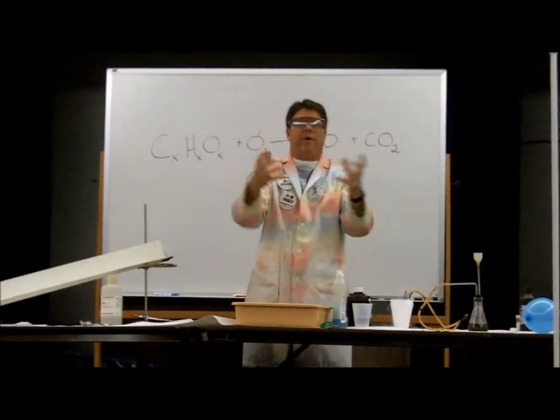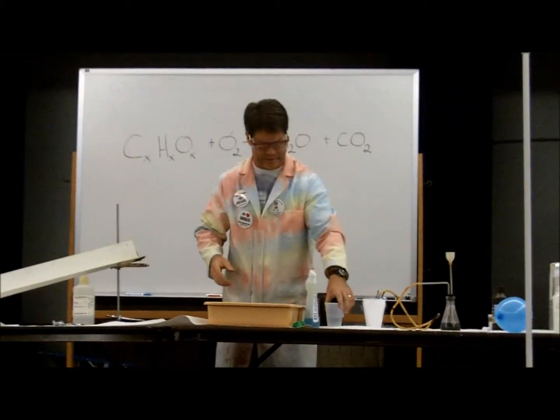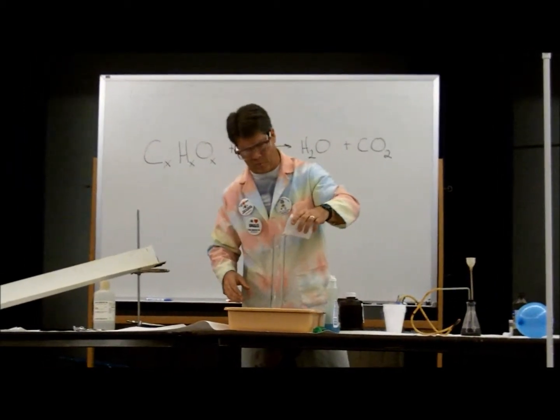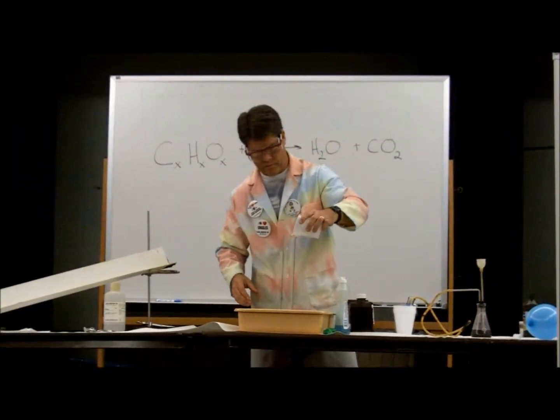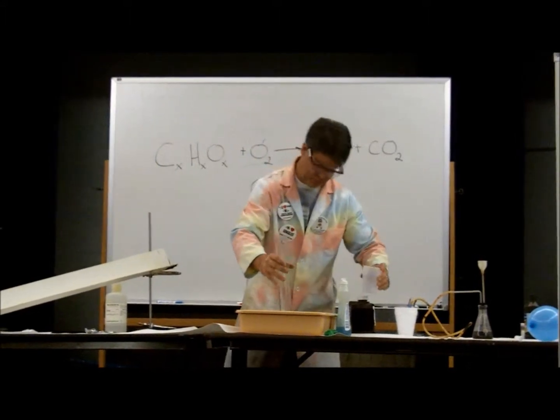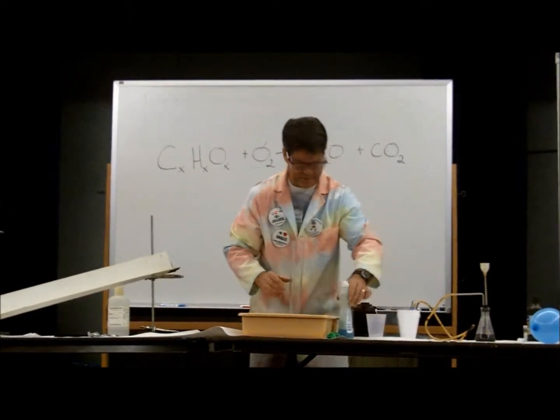There it goes. It's going to break apart that hydrogen peroxide again to produce that oxygen. So I'm going to dump some water in there. Enough is good. More is always better. All right.